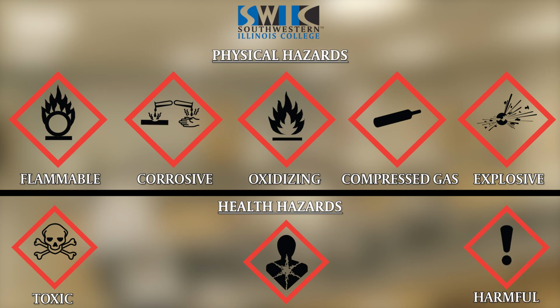Each hazard requires a specific set of safety measures that should be followed. Such safety measures are found in the safety data sheet, which we'll get to in a later section.